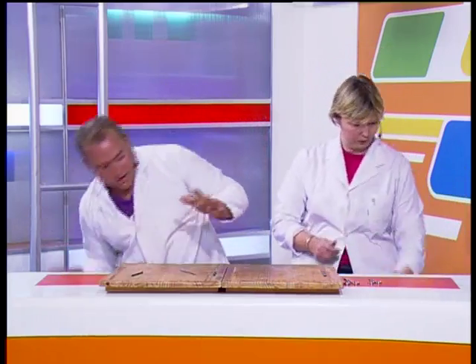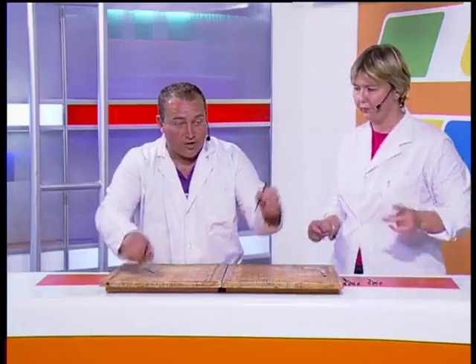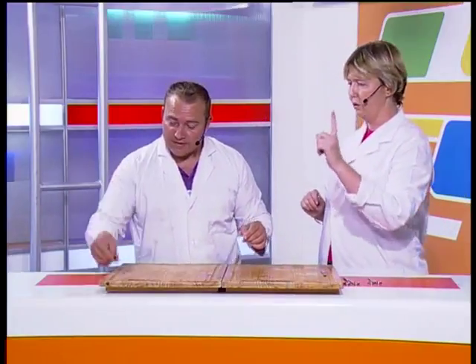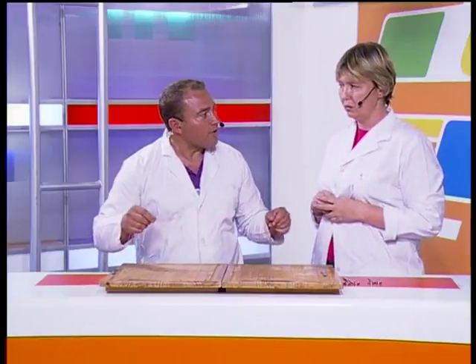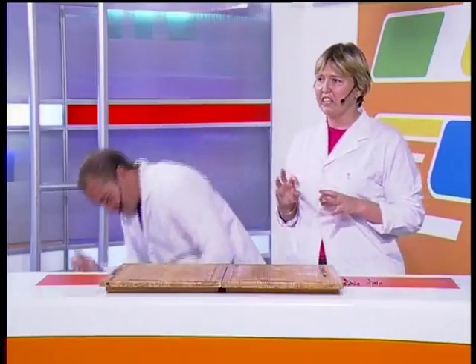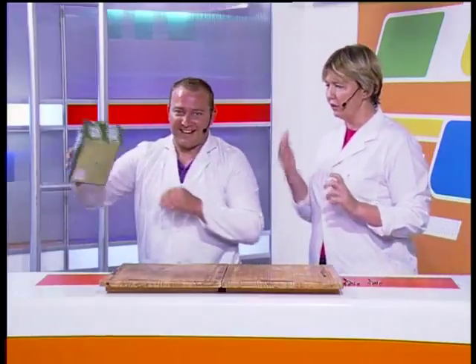Okay, so now we've got the main things that we need. We've got our dissecting needles, but they're going to be pointers today. We're going to have scalpels. We're going to have scissors. You know, we'll get there. I'm waiting for Looney to join. You've got to give Looney the good smelling stuff.